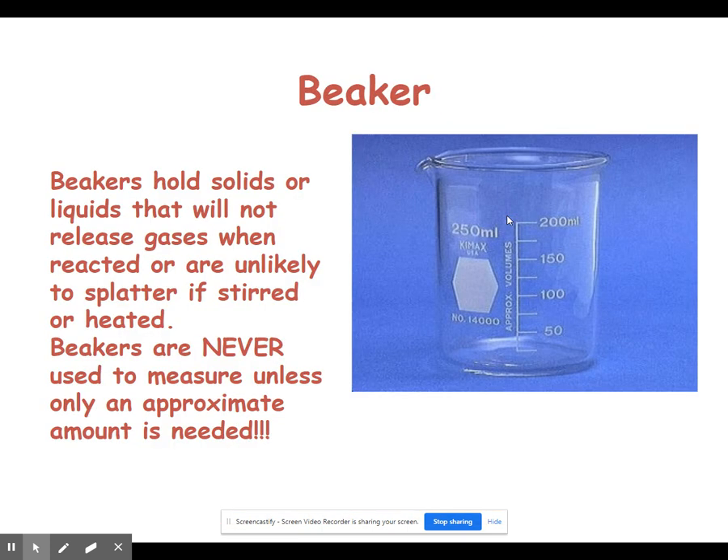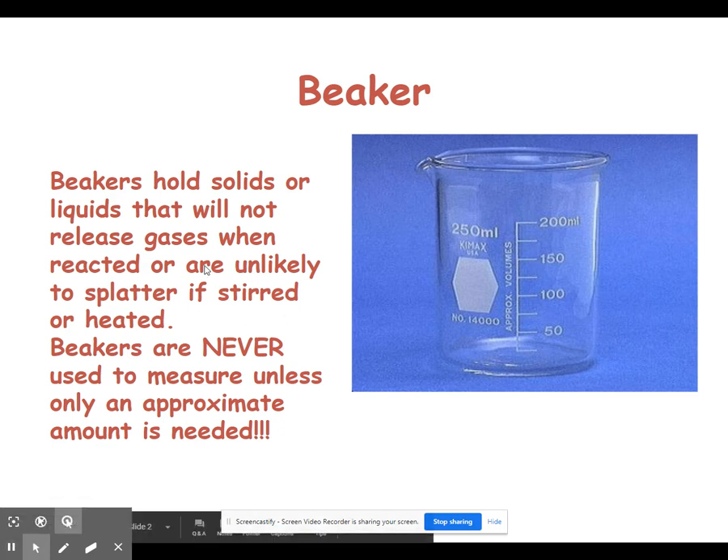The first and most common piece of lab equipment we'll talk about is a beaker. Beakers are our go-to tool for holding things, whether it's a liquid or a solid. One thing that's important to note is that we don't really use beakers to measure anything. The only time we would use a beaker to measure is if we needed around 100 or 150 milliliters, as beakers are not accurate — any measurement taken with a beaker is going to be very approximate. We can heat things using a beaker, but we don't want to heat things that might splatter or release a gas.